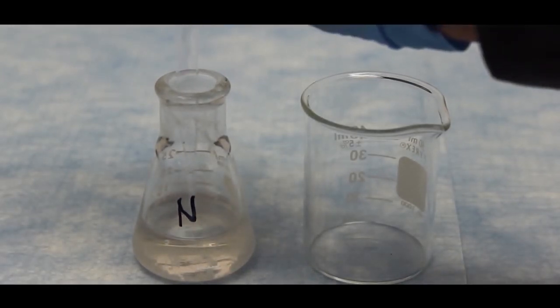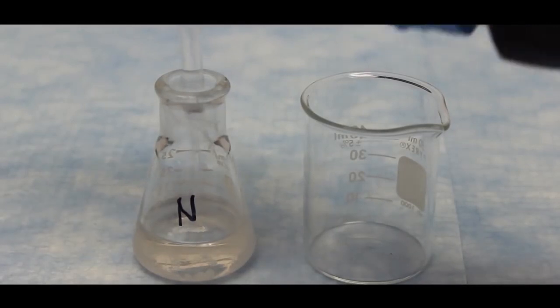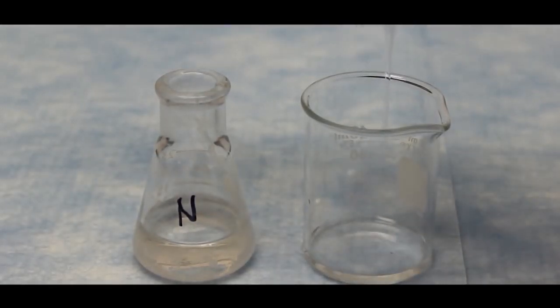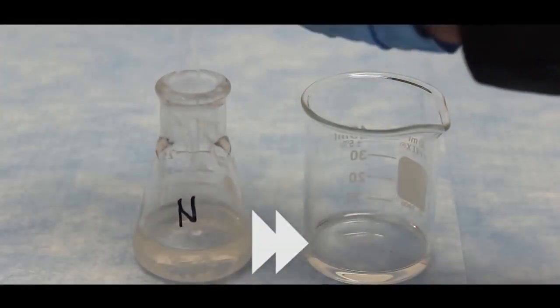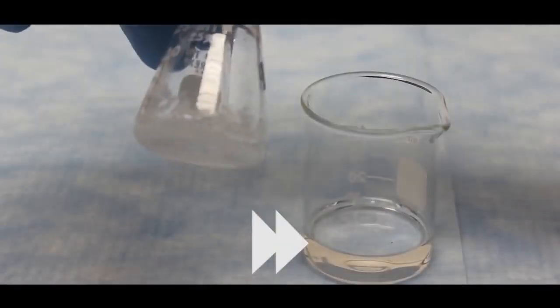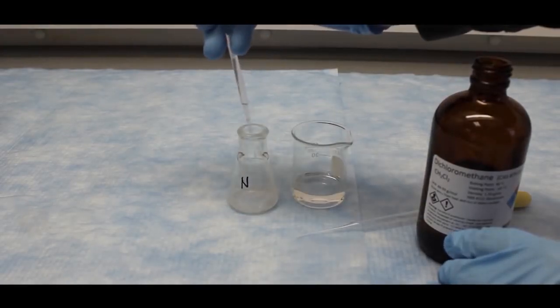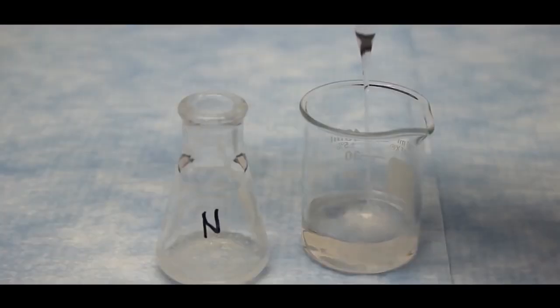To prevent any of the sodium sulfate from entering the pipette, positive pressure can be applied to the pipette bulb until it reaches the very bottom of the flask. To ensure I did not leave behind any of the phenanthrene, I will rinse the flask with a few more milliliters of additional DCM and then transfer that as well.